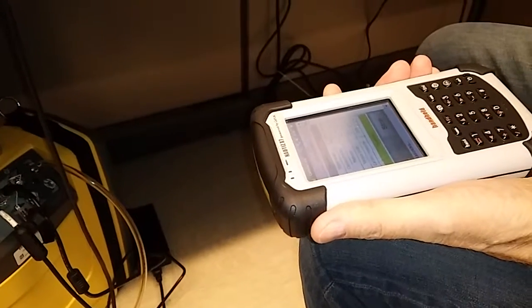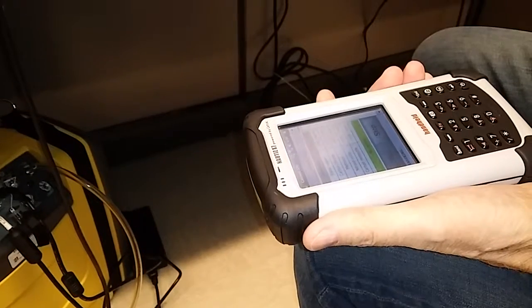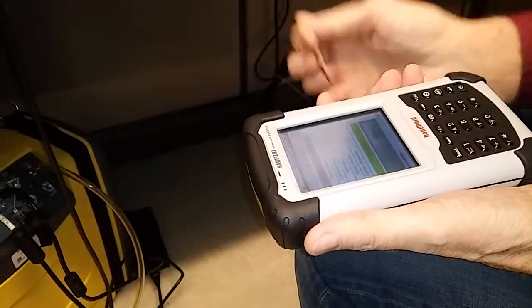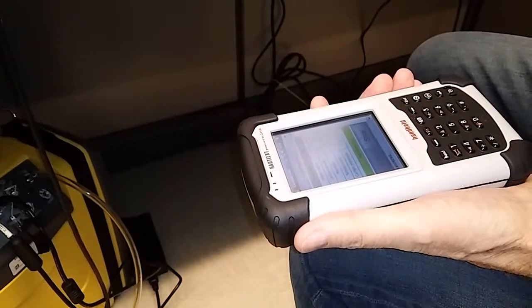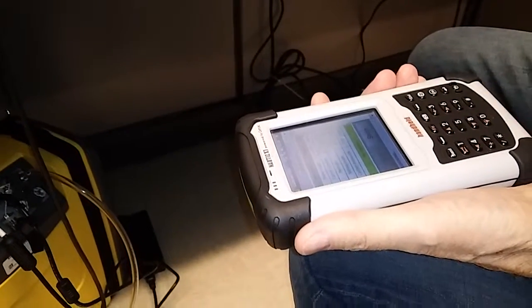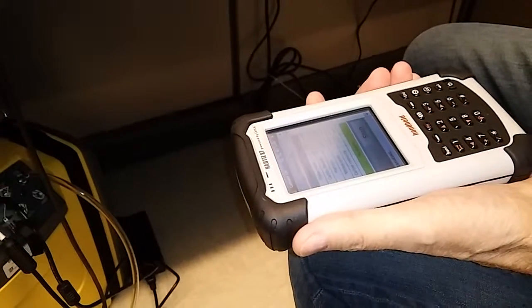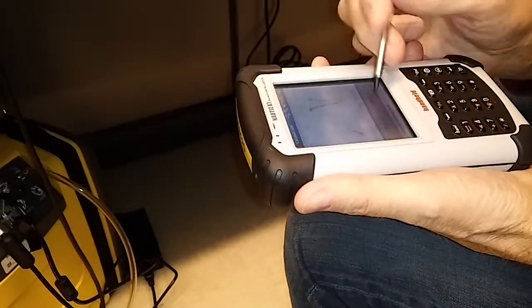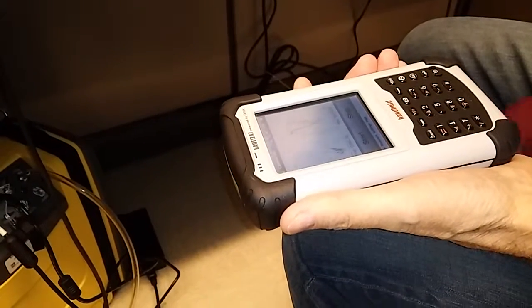Okay. Let's see, especially the carbon dioxide, that's the one you want to make sure, because if it's nitrogen, it should be basically zero. And of course, with all these people in the room, the carbon dioxide level should be pretty high. Okay, so that supposedly is the new spectrum for all of the different wavelengths.